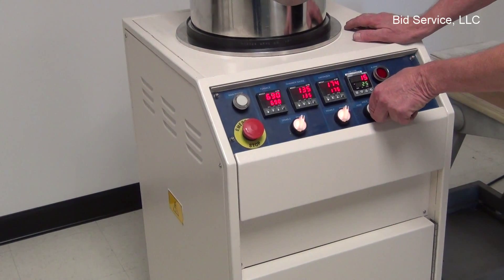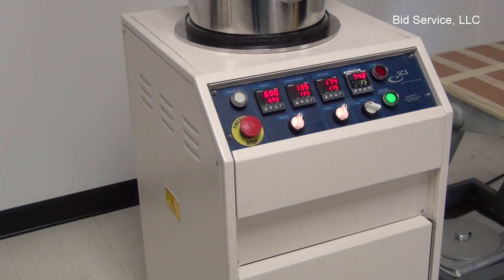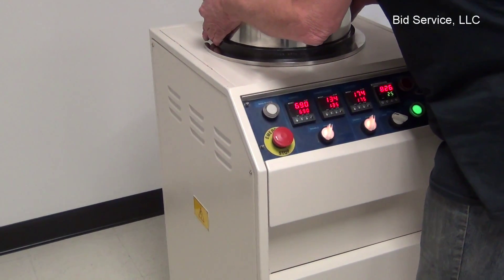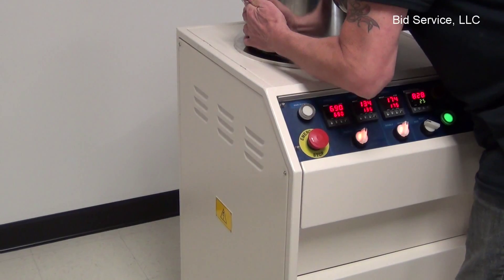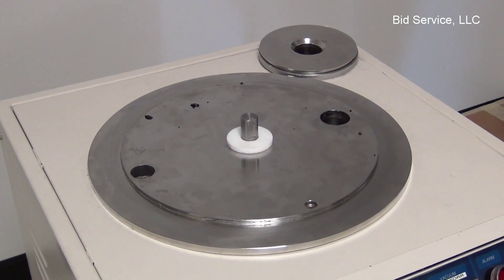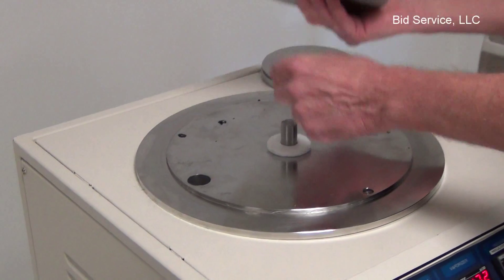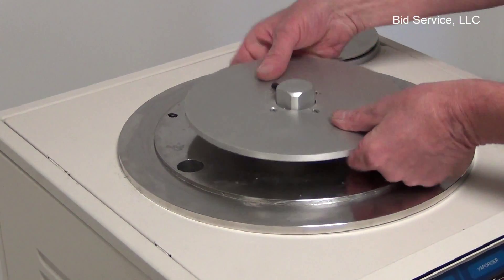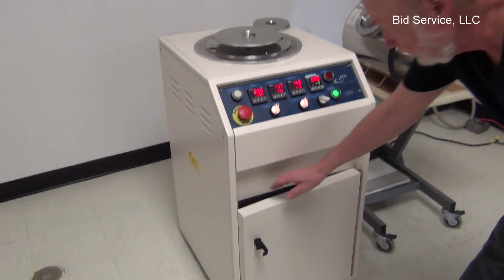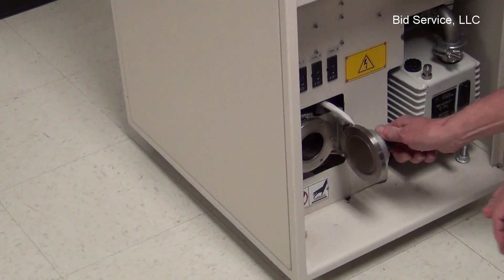To show you how it actually functions, I will vent the chamber. Let's take a look at the chamber. It includes a carousel that you can put your products on. I'm just going to open this.